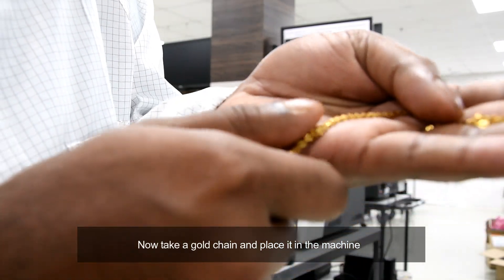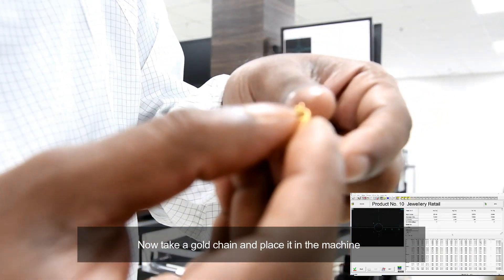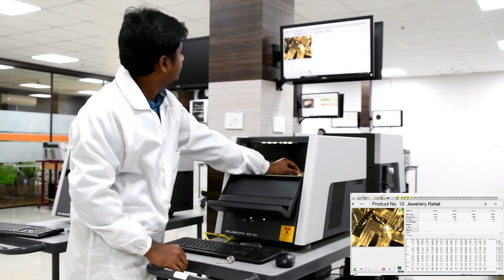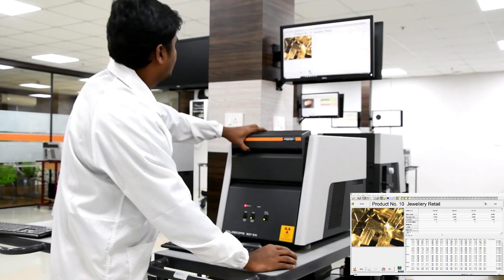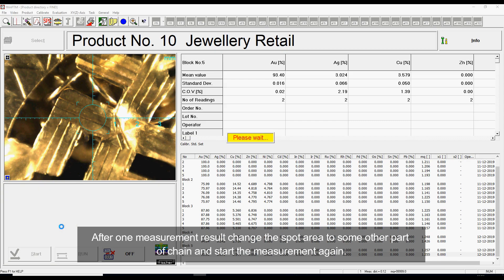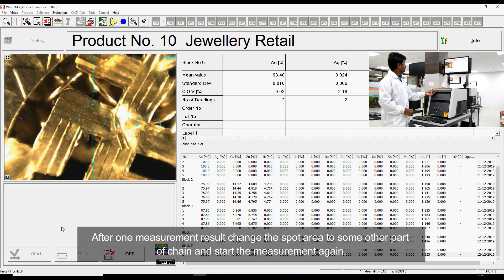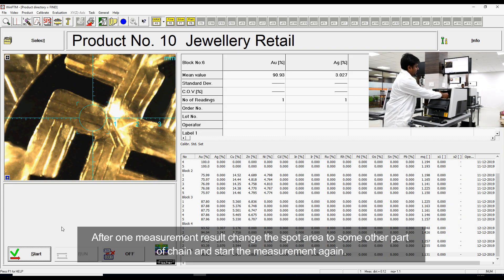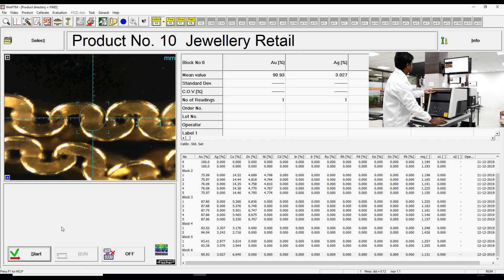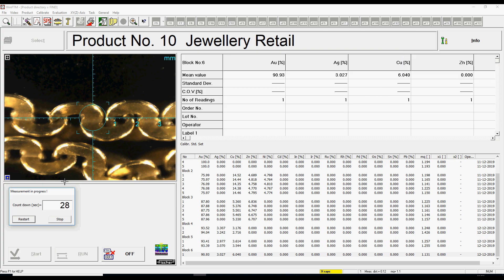Now take a gold chain and place it in the machine. After one measurement result, change the spot in the machine, move to another part of the chain and start the measurement again.